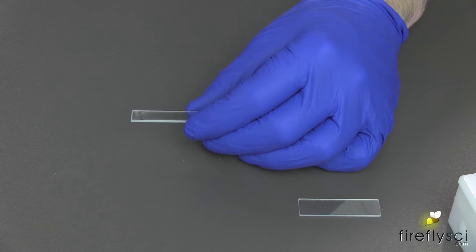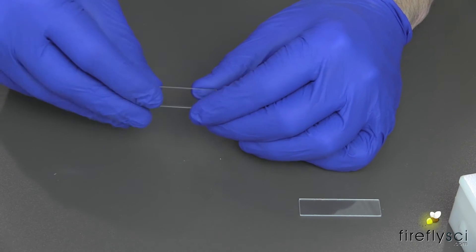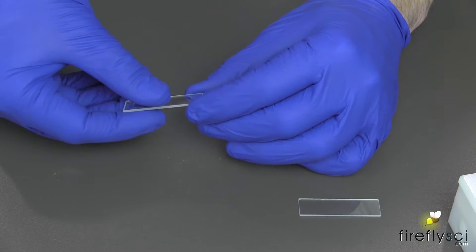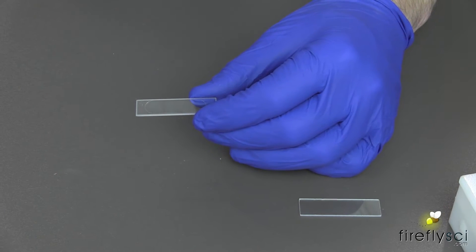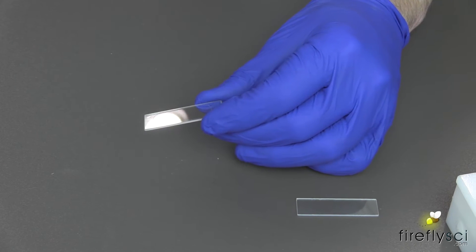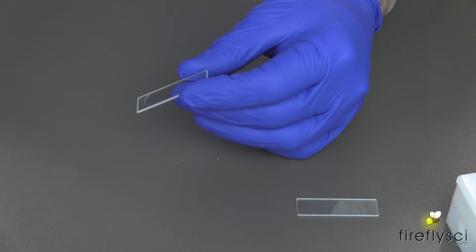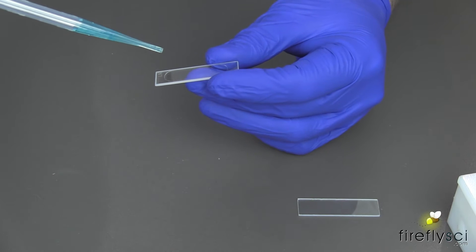We'll start with the Type 20 demountable cuvette. To inject the sample, first we make sure that the groove plate — which is the plate that we have right here — has the groove side facing up. When you run your finger along the cuvette, you should feel a slight bump at the edge. If not, you have to turn the plate over. Now I like to place a drop on the end of the cell and then make a small line of sample down the middle of the cell.